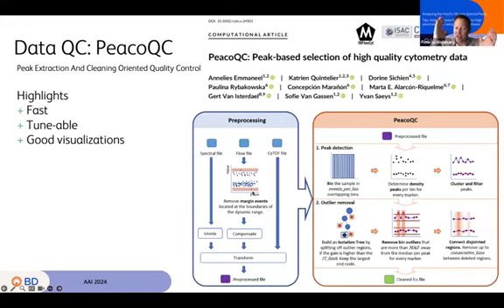So essentially events stuck to the top bin or the bottom bin on your axis on some parameter, because it's likely if they're stuck to the top bin, well, we just can't differentiate a single cell that was very bright from a pile of cells or debris stuck together or something that would have been way off the range, but because there's a limit to what your cytometer can measure, it just gets dropped into the top bins. We just generally want to remove all those.